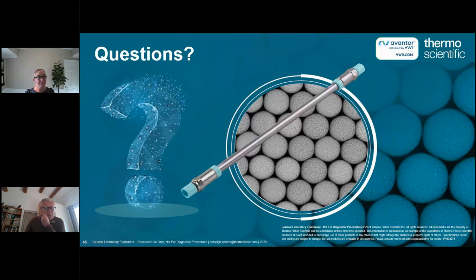Okay, thank you. Another one. What does inertness mean? Yeah, so inertness in liquid chromatography refers to the lack of adsorption of the analyte onto wetted surfaces.